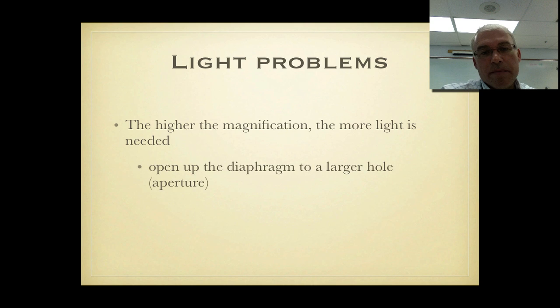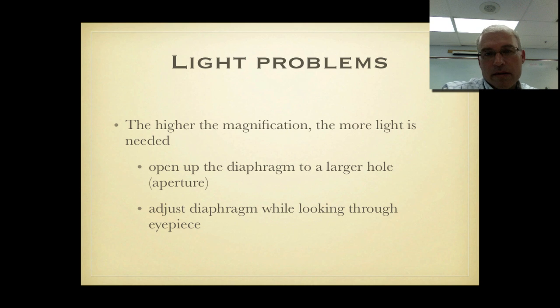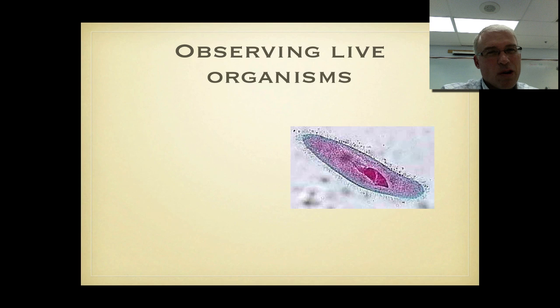Some problems with light. The higher the magnification the more light you're going to need. So how do you increase the amount of light? Well you're going to open up the diaphragm. If you look under the stage if you tilt your microscope carefully you'll notice that the diaphragm is a wheel with holes in it. The larger the hole the more light it's going to let through up to the stage. So in order to increase the light you just rotate the diaphragm to a larger hole. And you adjust the diaphragm while you're looking through the eyepiece. You'll see there's a little wheel you can turn with your finger. Like I said the diaphragm is like the secret weapon of the light microscope. So learn how to use it.